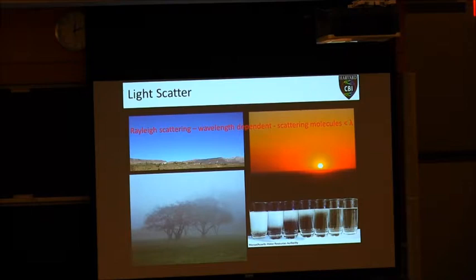Okay? And so these particles here, the water droplets and the air bubbles, are actually larger than the wavelength of light. This is referred to as Mie scattering. It's not wavelength dependent. We're scattering all of those wavelengths all at the same time. And those scattering particles are all much larger than the wavelength of light.